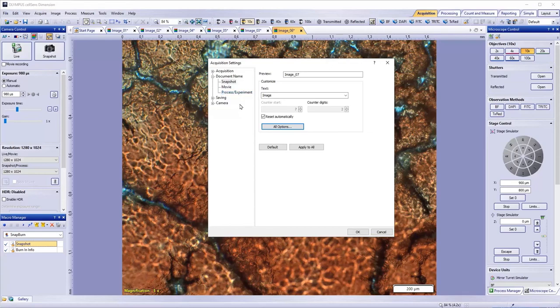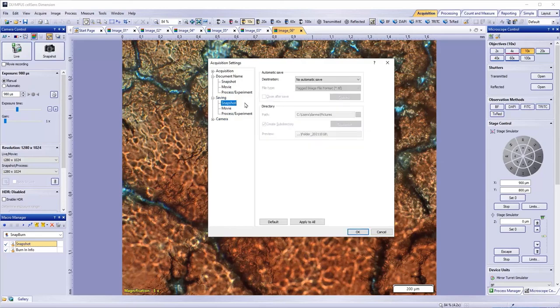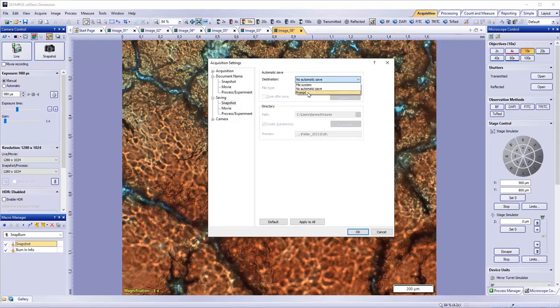You can also configure the software to automatically save images, movies, and processes. This is also found in Acquisition Settings, under Saving. To enable automatic saving, choose the File System. Selecting Prompt will bring up a Save As dialog every time you hit Snapshot.